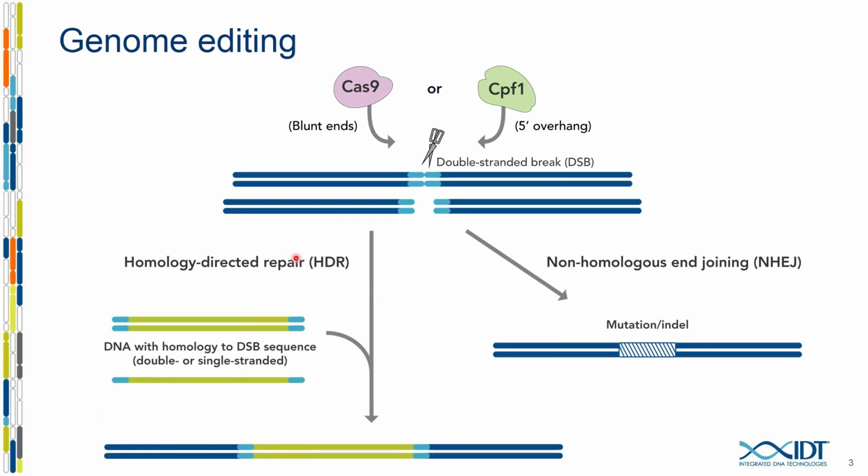So just to get into the basics of CRISPR, at IDT we sell two different Alt-R CRISPR products. The Cas9 from Streptococcus pyogenes, as well as the Cpf1 protein from Acidaminococcus species. Cas9, of course, recognizes the canonical NGG PAM. So anywhere in the genome where you've got a di-G nucleotide, you could theoretically have a Cas9 cleavage site. Cpf1 recognizes the TTTV PAM, or triple T followed by anything other than another T. Cas9 can leave blunt ends, whereas Cpf1 leaves 5' overhangs.